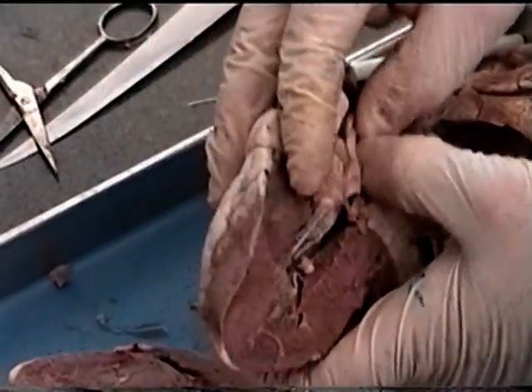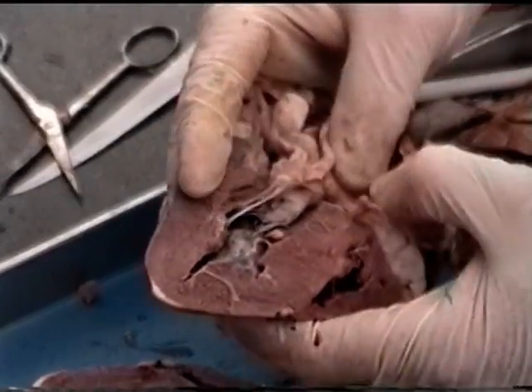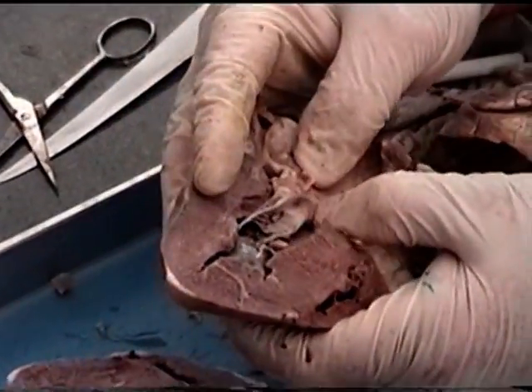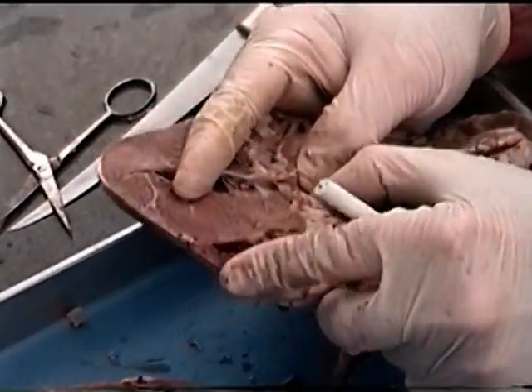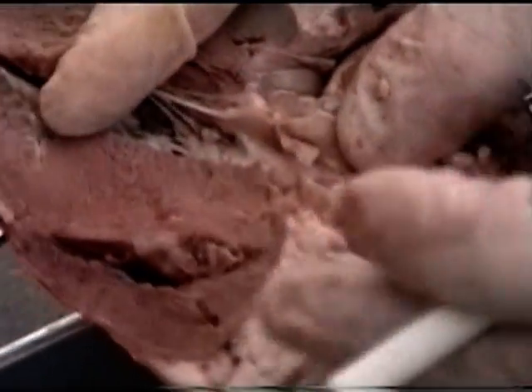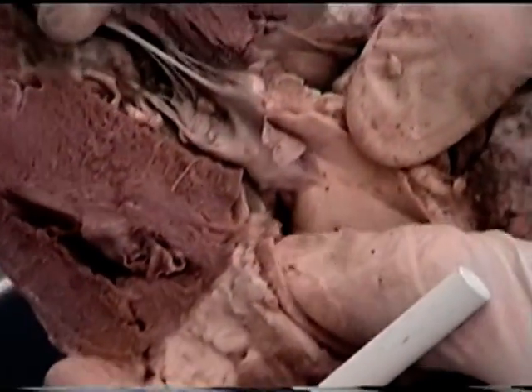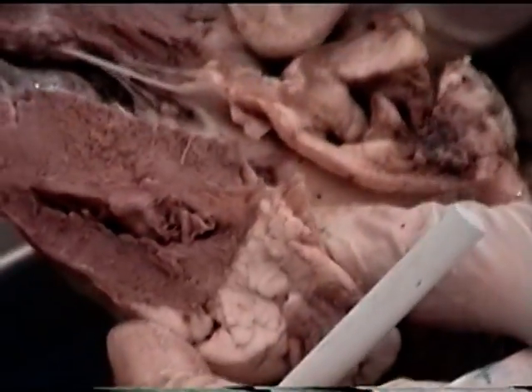So now we can pull the aorta apart where it's coming out of the left ventricle. And what we're going to see is right here is the flap of a valve. And so when we look at this, here's the flap of a valve that we can see. I'm going to stick my thumb in it here. And this flap of this valve is the aortic semilunar valve that we're seeing that we cut through here. Here's part of the flap, and then we would see more of it over here where it creates a little cup. So this little cup my thumb is in would fill with blood, and that causes that valve to close.